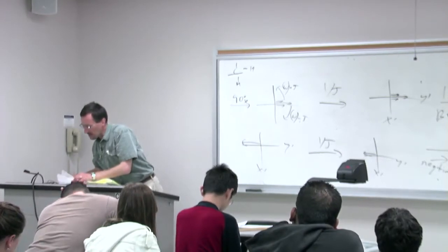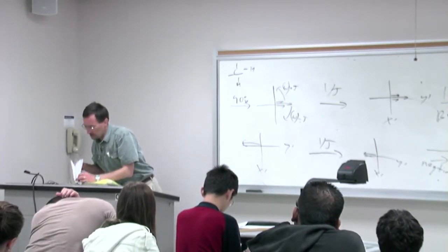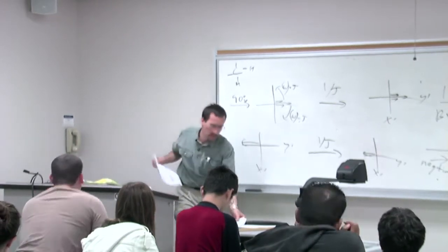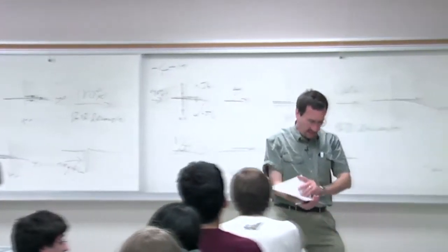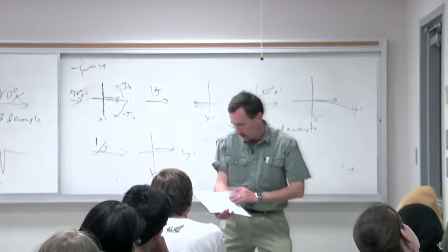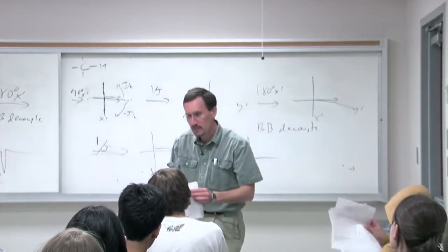The APT is written up in Phil's handbook, so you can actually use it, but in practice you'd have no reason to use it versus the more modern DEPT experiment. I just like this because I think it's something that we can easily wrap our heads around for starters without too much mental gymnastics.